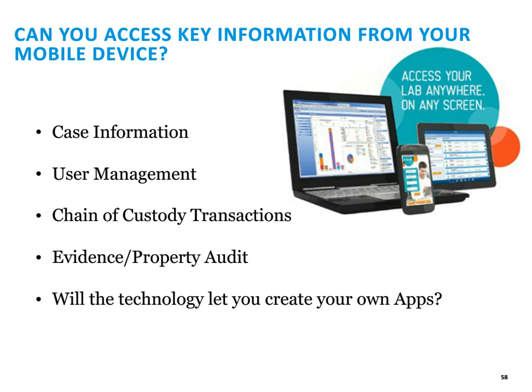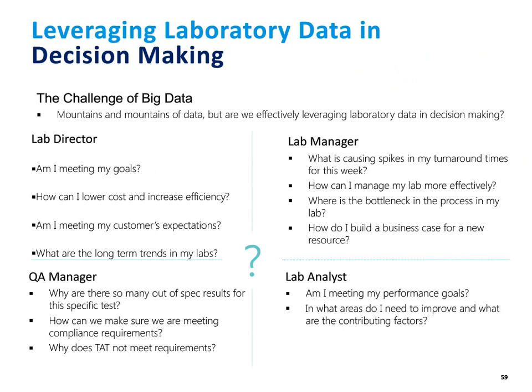And then another really big topic is big data. We have lots of data, and data is great, but it really isn't very useful unless you can turn it into actionable information. All this data that we're collecting, we want to be able to look at it in a way that helps us make informed decisions to make our operations run better, faster, smoother. So be thinking about, are there products out there and the vendors that you're looking at that can provide some sort of business intelligence tool as part of their LIMS solution?